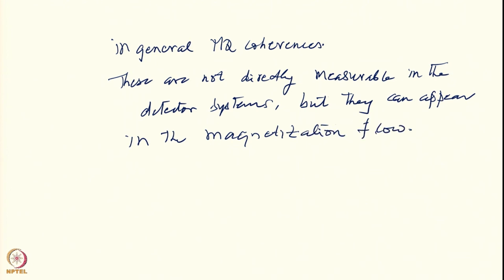Okay. So, therefore, when you are having multiple experiments, various kinds of transfers at various places, all these kinds of terms will appear. And we are going to use this in all these multidimensional NMR experiments, which we will discuss as various kinds of correlation experiments which I mentioned to you. They will come across all of these kinds of terms, and therefore it is important to understand what we are talking about here.